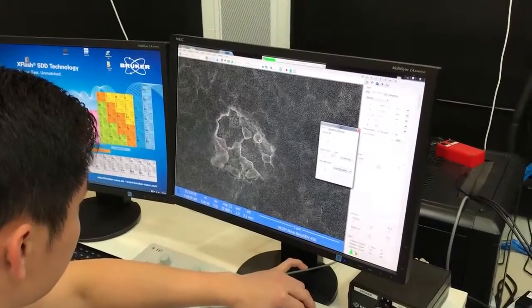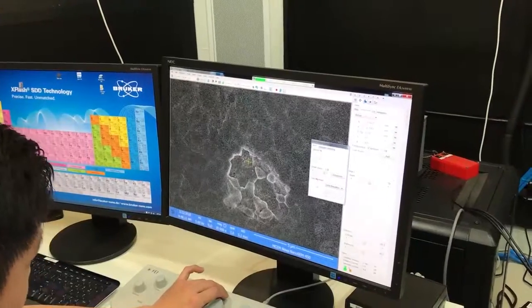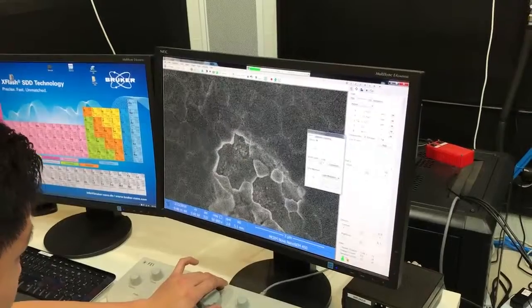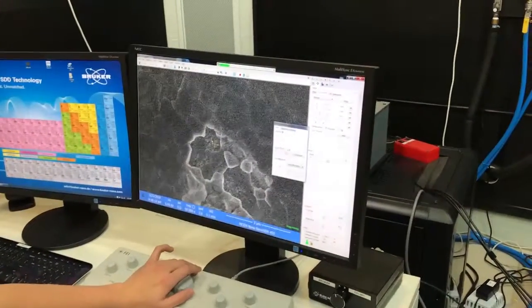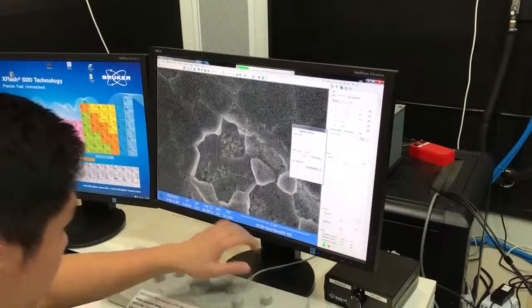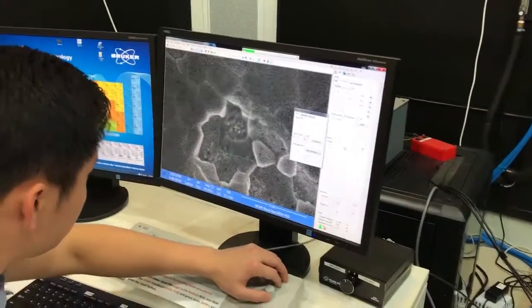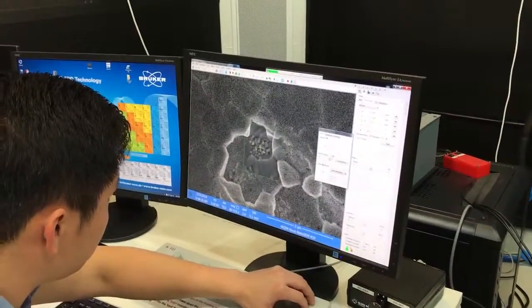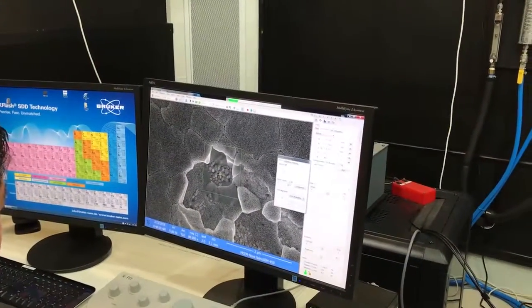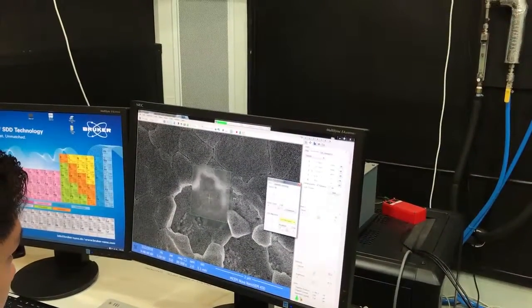Is that because there are lots of... Is that where the film has broken away a little bit and you've got really nice edge effects and you've got transmission through different flaky bits? Yeah, that's right. So you guys should be able to understand that from the interaction volume and the presence of more electron transparent regions and texture in the specimen. Don't forget the secondary electron escape depth and the relationship of edges with that.